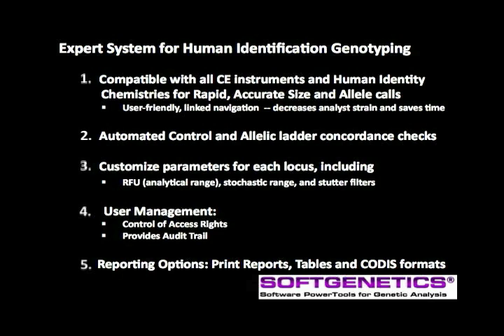GeneMarkerHID is an expert system for human identification genotyping from short tandem repeat, or STR, data. The program is compatible with all CE instruments and human identification chemistries, providing rapid, accurate size and allele calls. The user-friendly linked navigation decreases analyst fatigue and saves time. The program includes automated control and allelic ladder concordance checks and the ability to customize quality flagging parameters for each locus, including settings for analytical range, stochastic range, stutter filters, and heterozygous imbalance level.